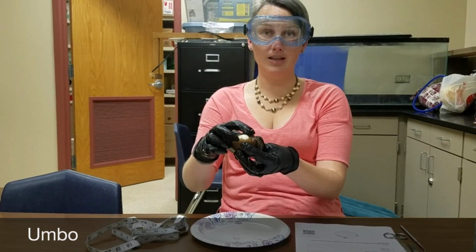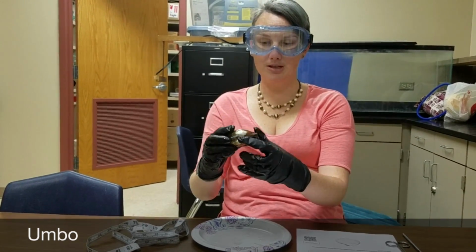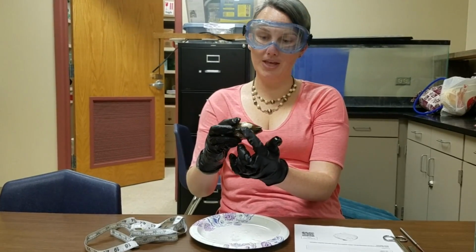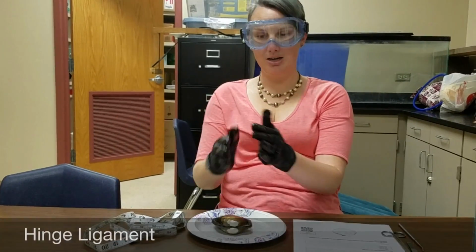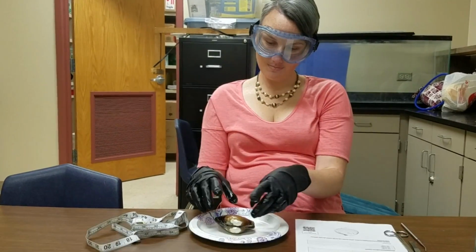Once you find the umbos, you can find where the shell is connected. The umbos are on either side of another thing that you're going to look for called the hinge ligament. So the umbos are on either side of the hinge ligament. The hinge ligament is where the shell connects and does its opening and shutting thing.